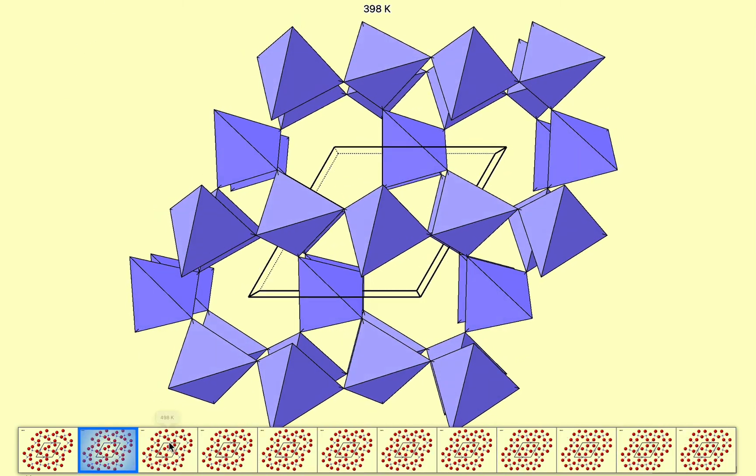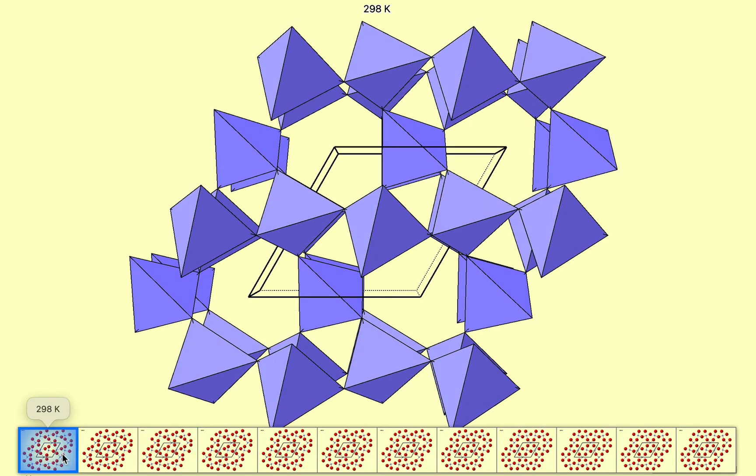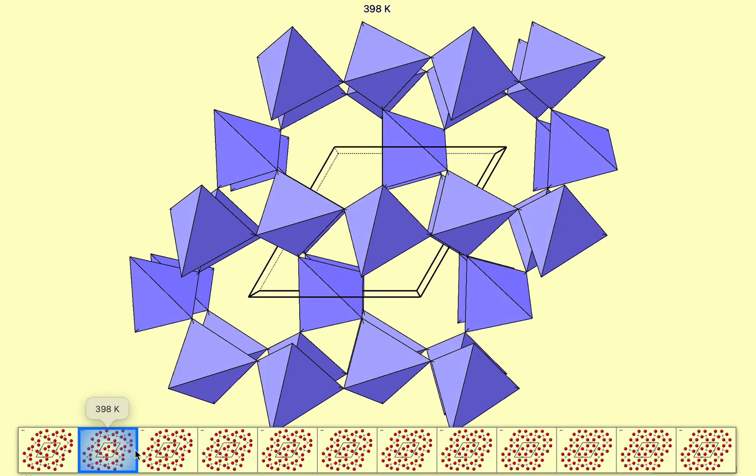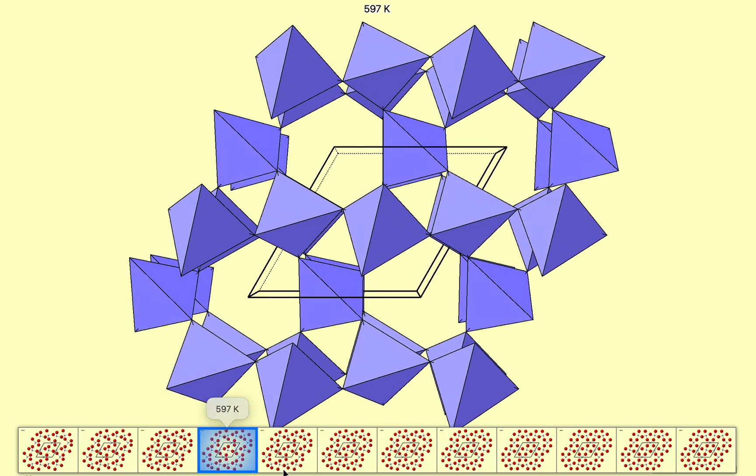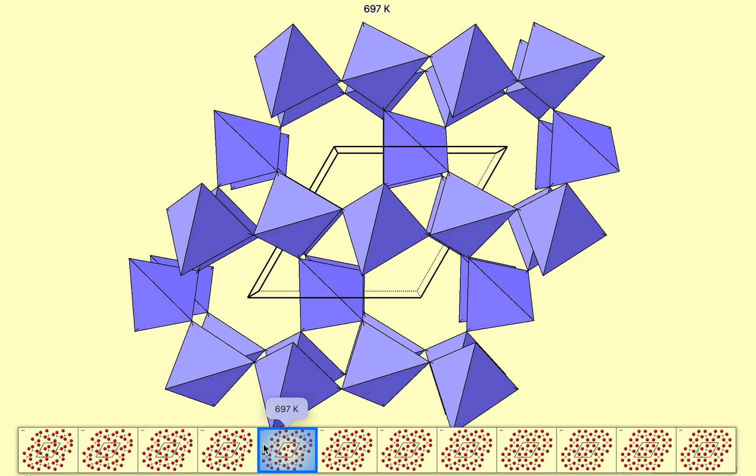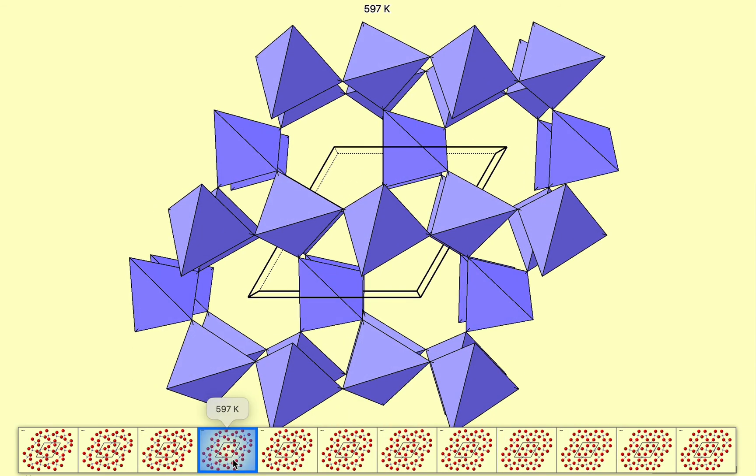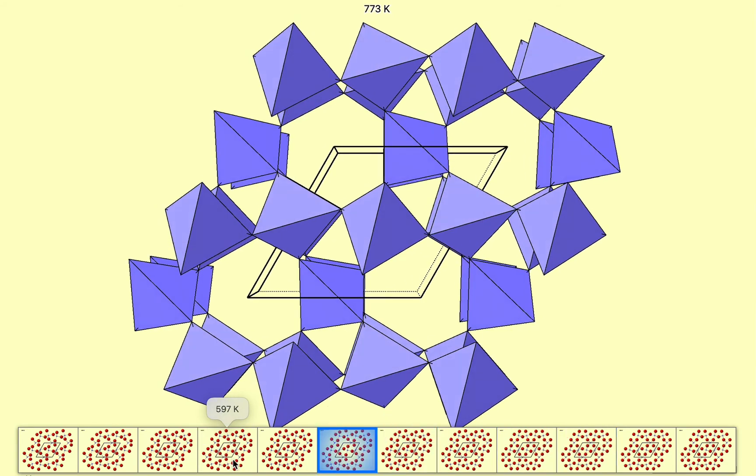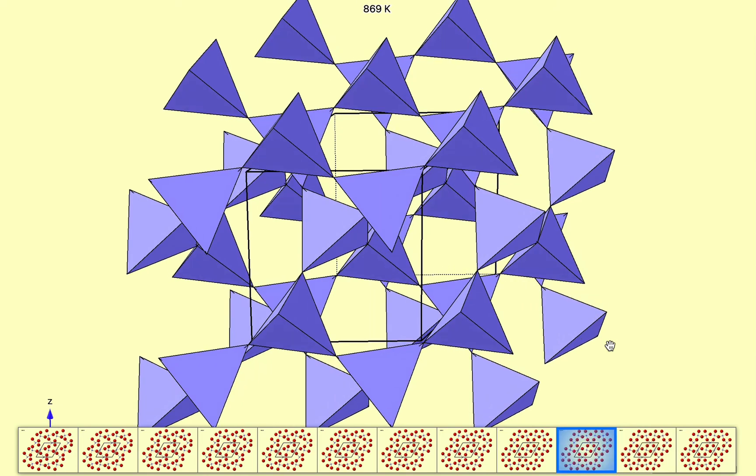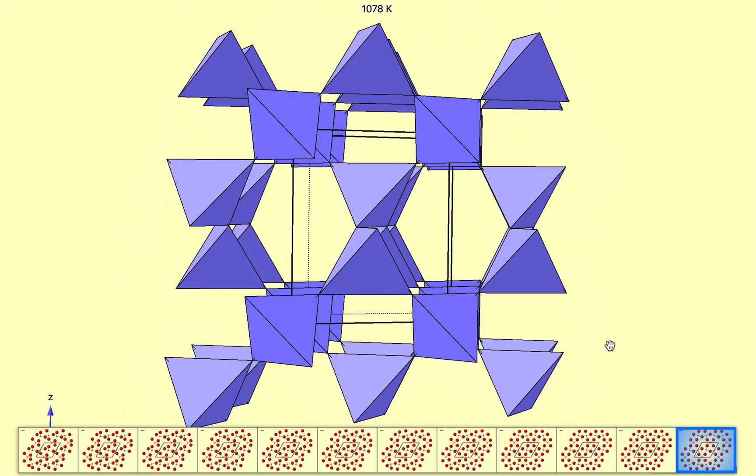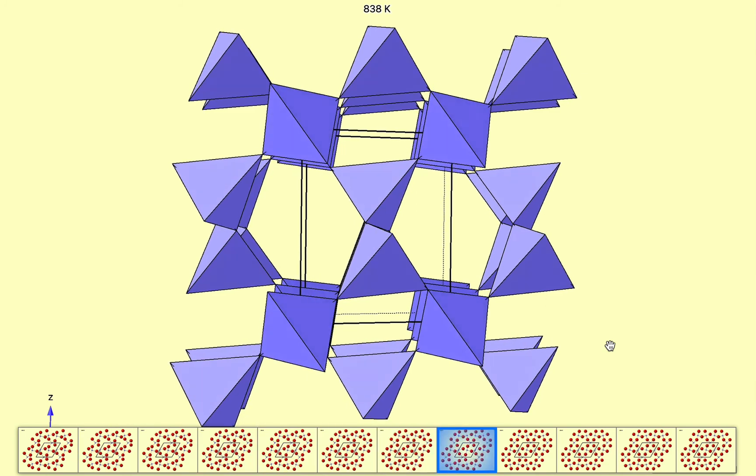Now we're going to stop the animation by just clicking on a thumbnail. This is the low-temperature phase of quartz and I can click and drag with a mouse to scrub backwards and forwards through the sequence. Let's restart the animation by double-clicking and the really cool thing is that I can rotate the structure whilst it's animating so we can see how it looks from different directions.